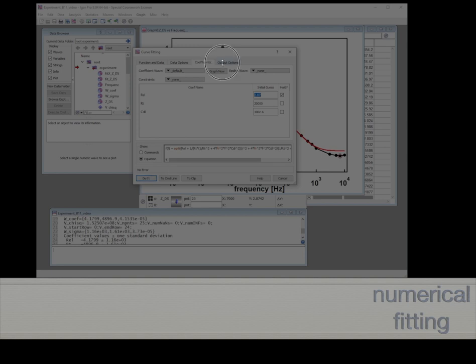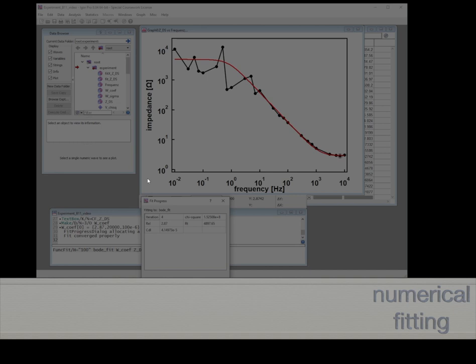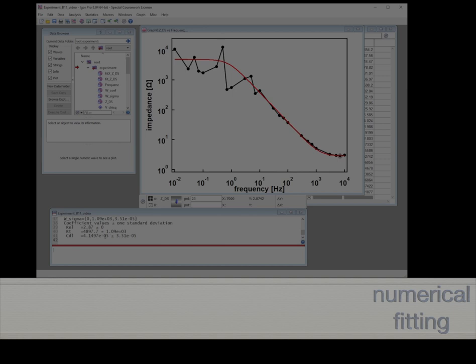Before we disable the text box to the graph, we do fit again. Now we see that it's pretty nice that the electrolyte resistance is given precisely. But now we have a different capacitance of 41 microfarads, and the error is 35. That is our result now.